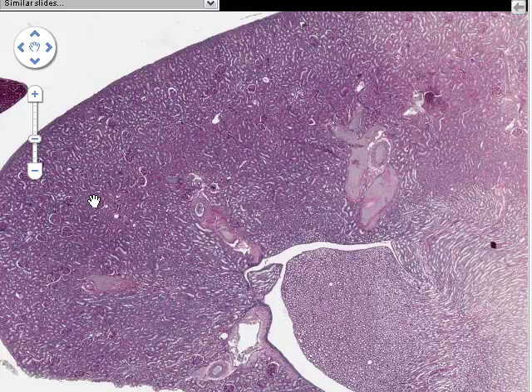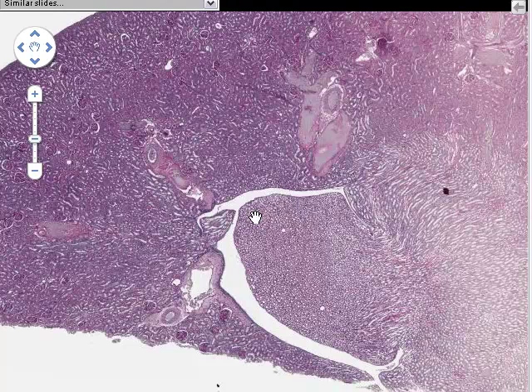We're going to avoid looking in this region out here, where although there is simple cuboidal epithelium, it's a little more difficult to interpret. But perhaps after you've looked at the simpler, easier material which we're going to look at just now, you might want to return out here and see if you can see tubes lined with simple cuboidal epithelium. For now, we're going to look, to begin with, at this little piece of tissue that projects inward here.